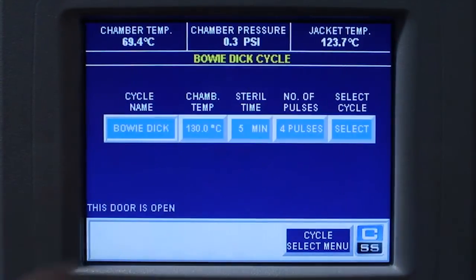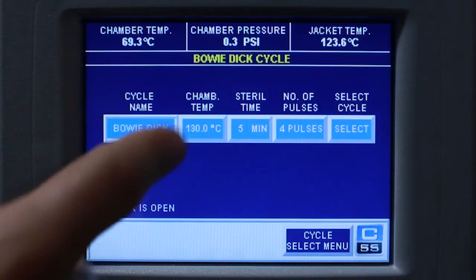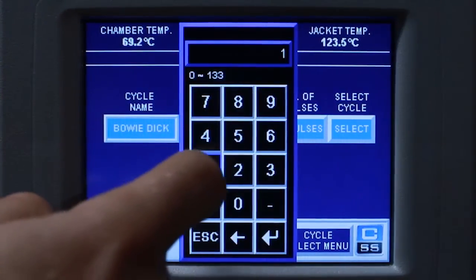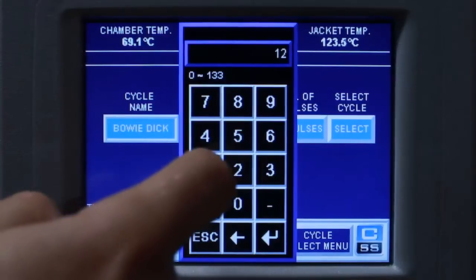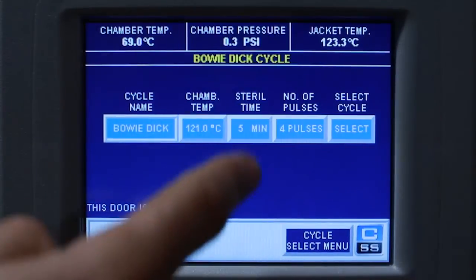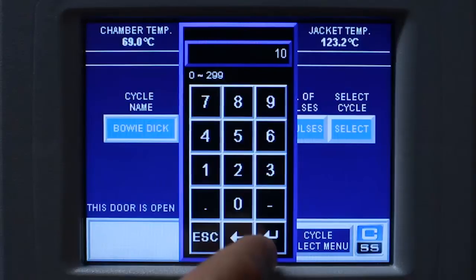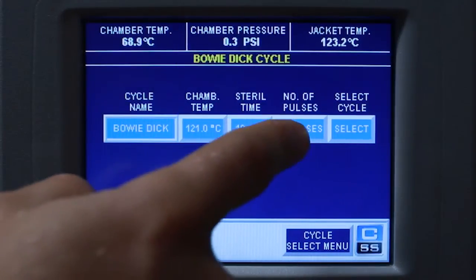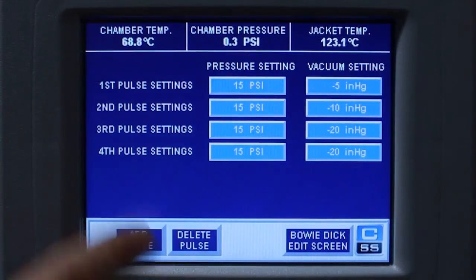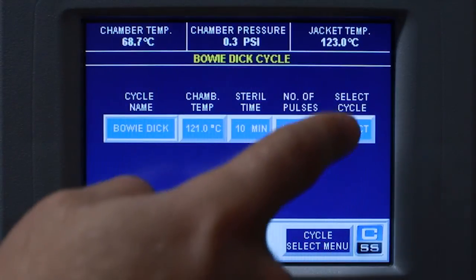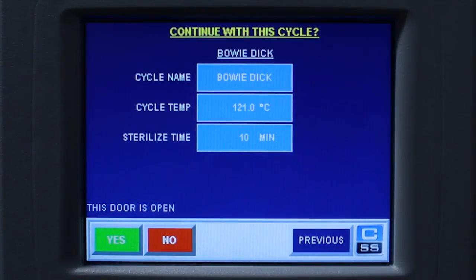Enter your chamber sterilization temperature. Enter your sterilization time. Enter the number of pre-vacuum pulses you want and press select. Once you have verified your cycle parameters and your door is closed, click yes and your cycle will start.